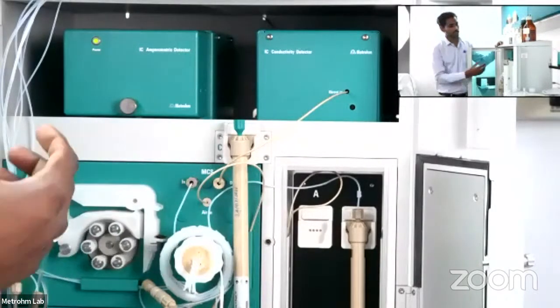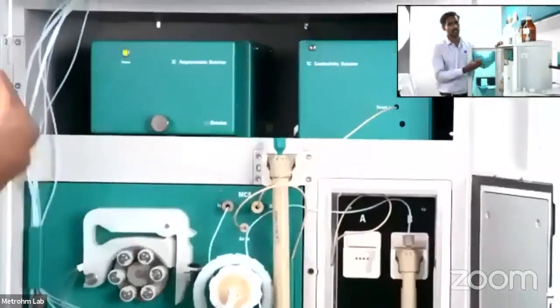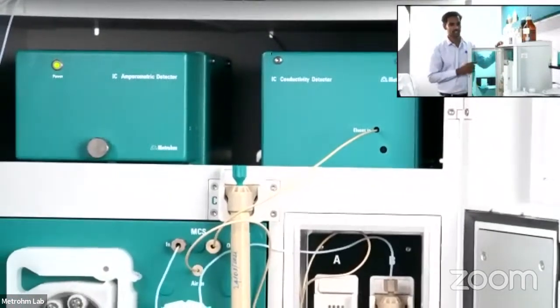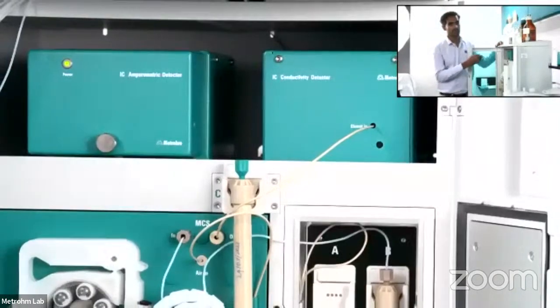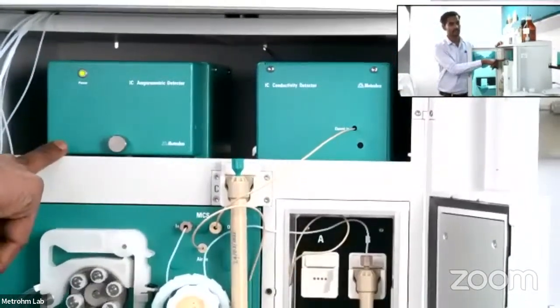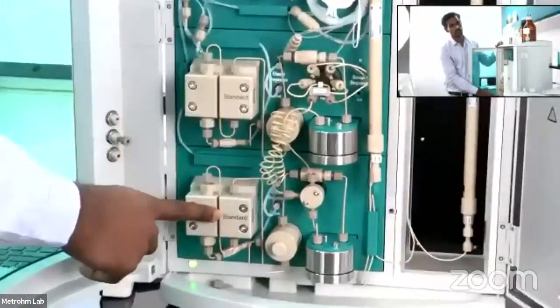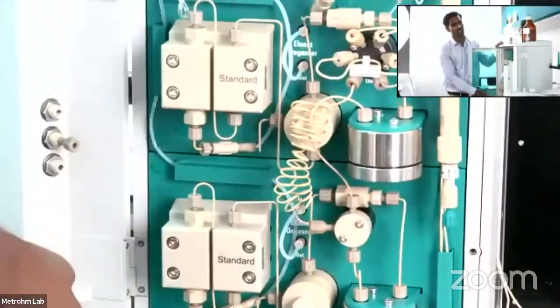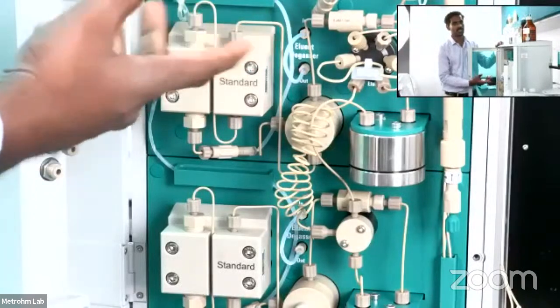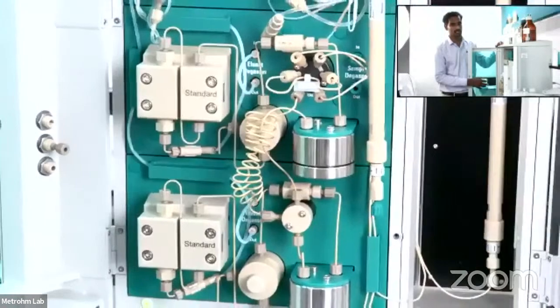Okay, and you can see one more part, called the amperometric detector. So we can do anions and carbohydrates simultaneously with the help of this instrument. At a time we can connect two different detectors. Right now it is a conductivity and an amperometric detector. As well as we have two different pumps. This one is used for anion or cation applications. Another pump can be used for carbohydrate applications. So simultaneous application can be done with this instrument. Okay, so that is the advantage.